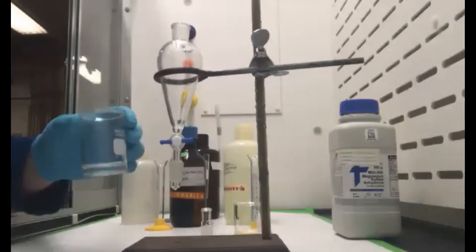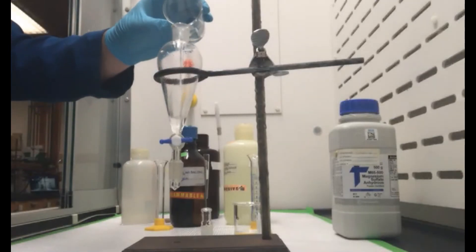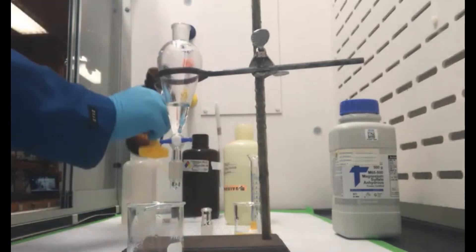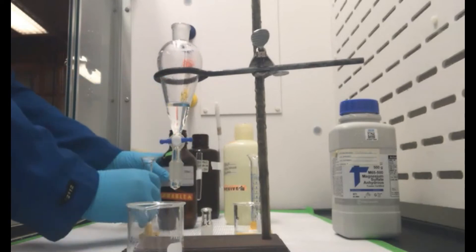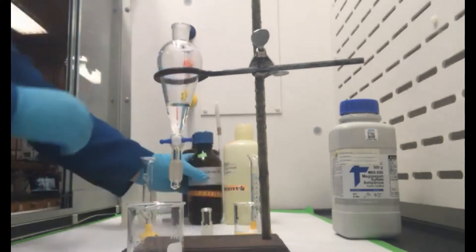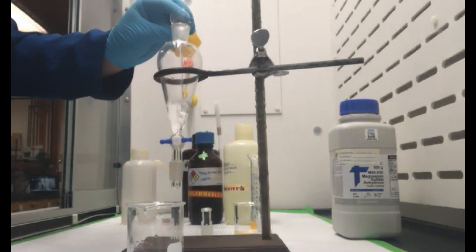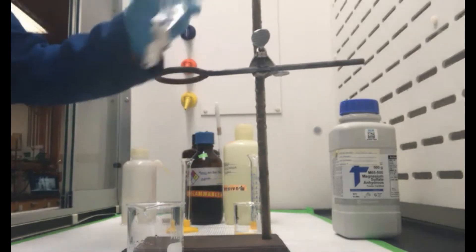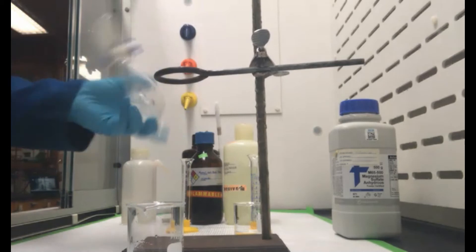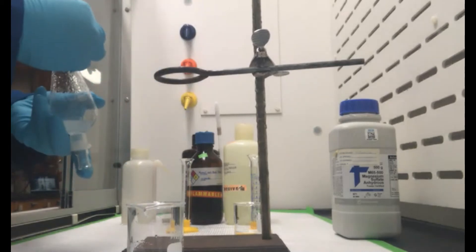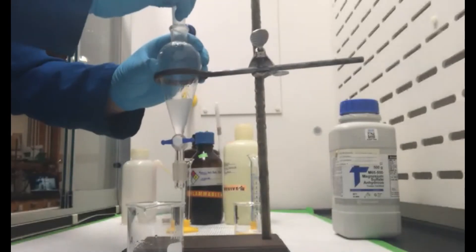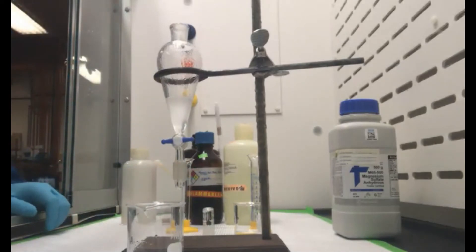Now I want to extract again from my water. I'm going to add the water back to the sep funnel. And we're going to use another five mils of MTBE and do our extraction again. I'll let these layers go ahead and separate out.